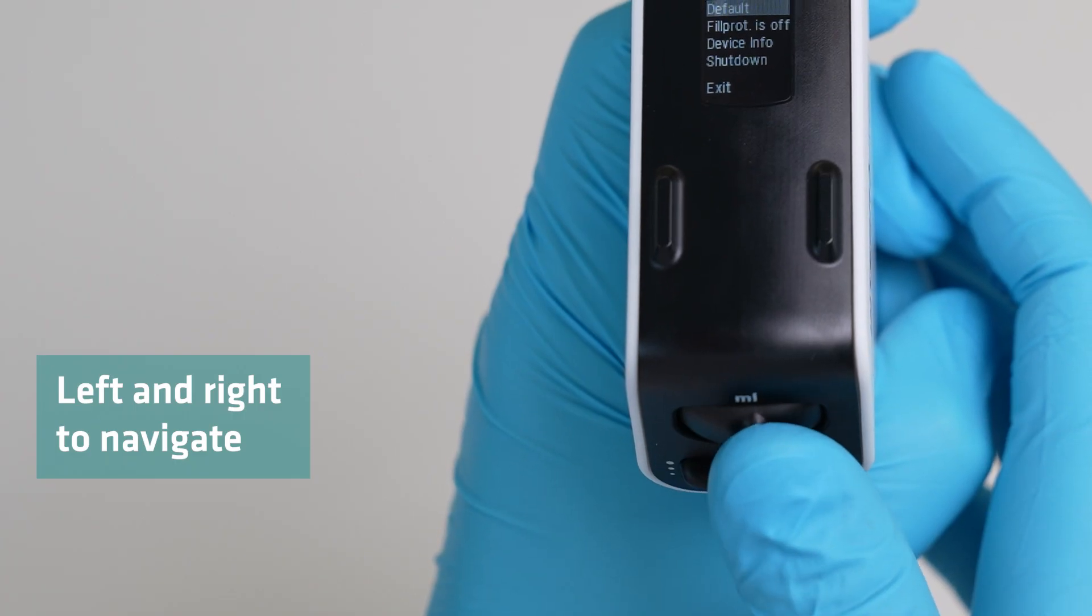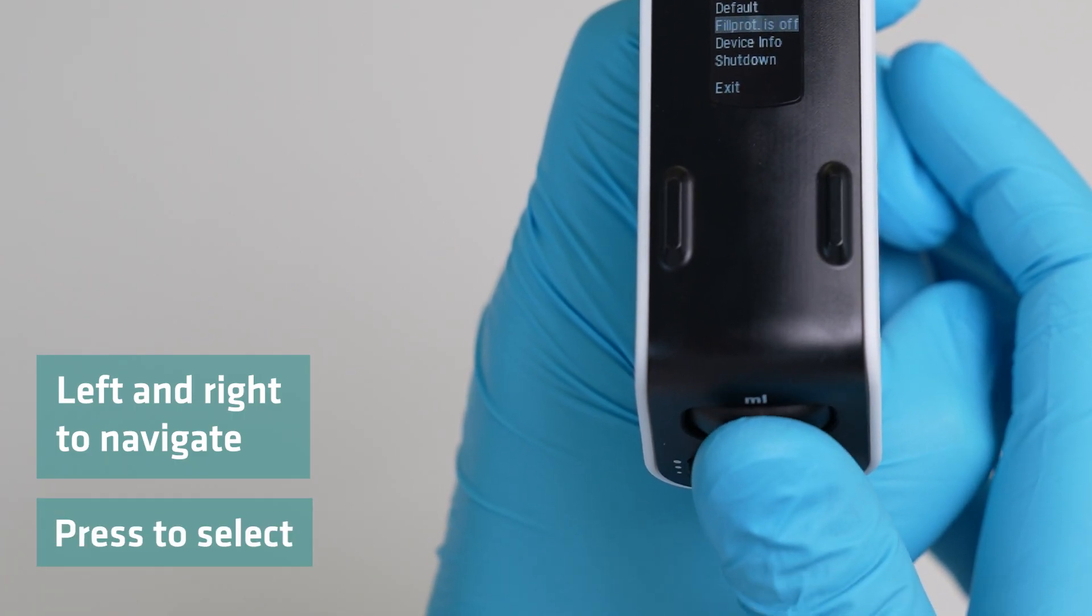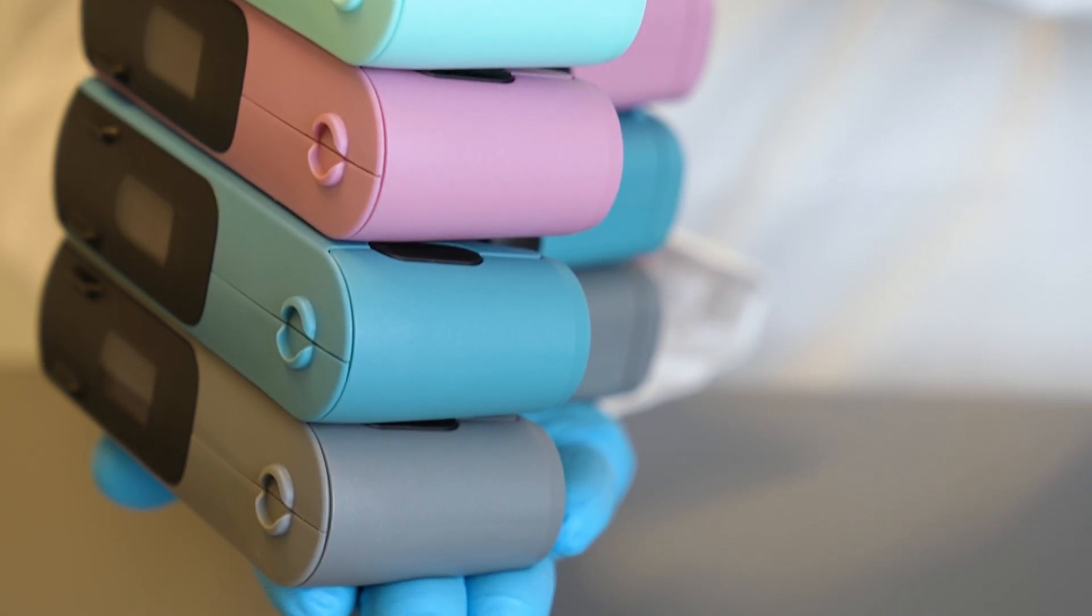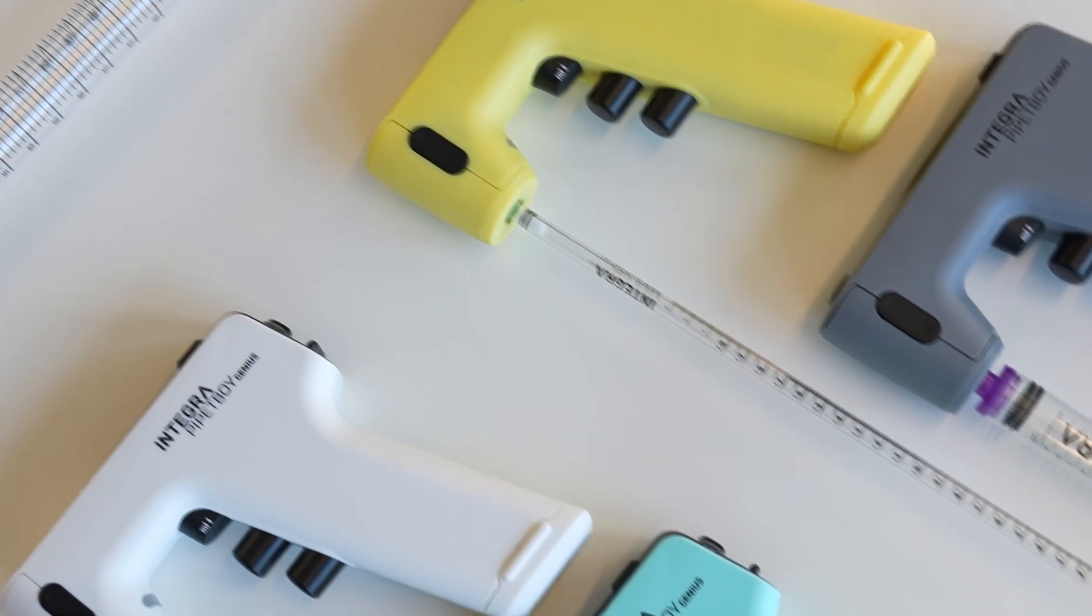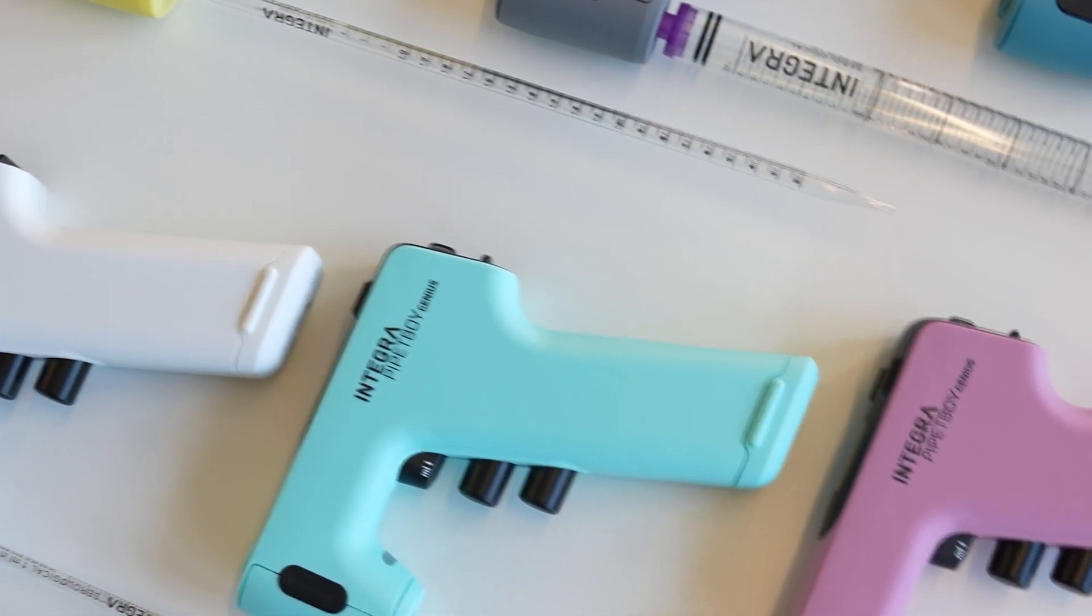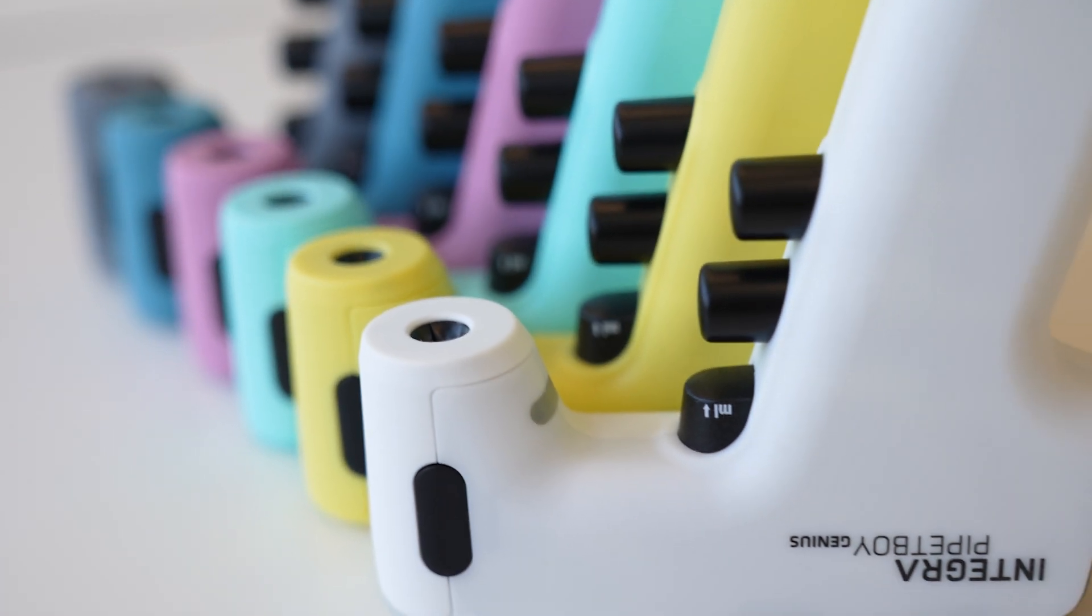If there's anything not covered in this video, just contact us and we'd be more than happy to help. For more information on how our Pipette Boy Genius can transform your lab experience, visit our website.